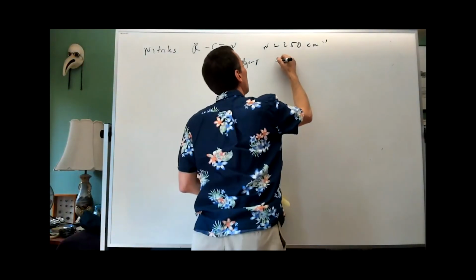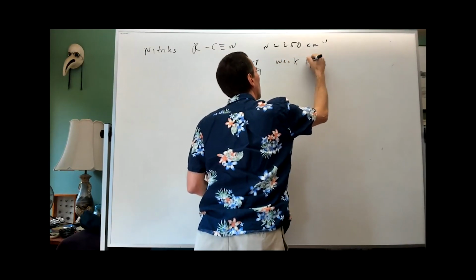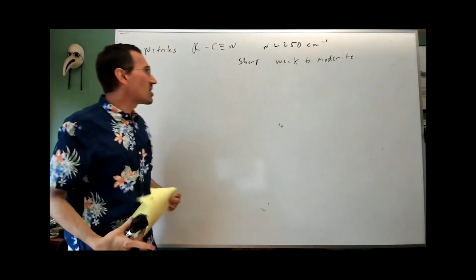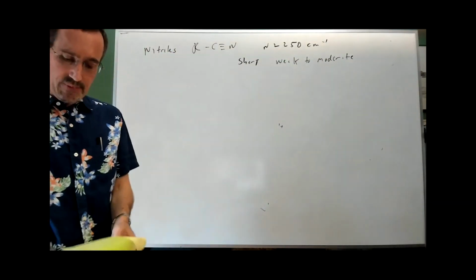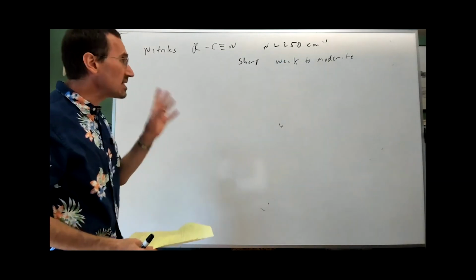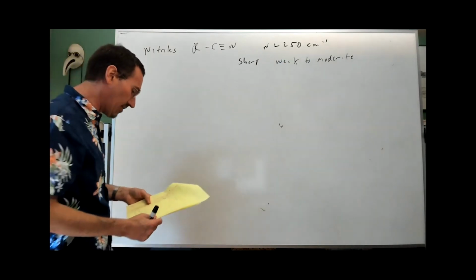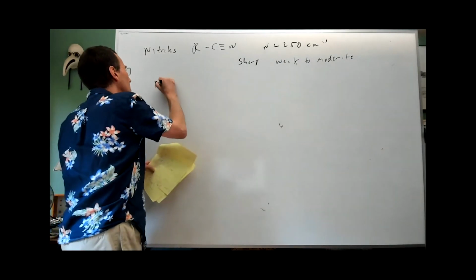It's sort of weak. We'll call it weak to moderate. That region of the IR spectrum around 2000 is unusual because there's not that much that appears here. And so it's easy to see, but because it's small and because sometimes other things might come there, like I said, if you somehow had deuterochloroform in your sample, it might be easy to miss.